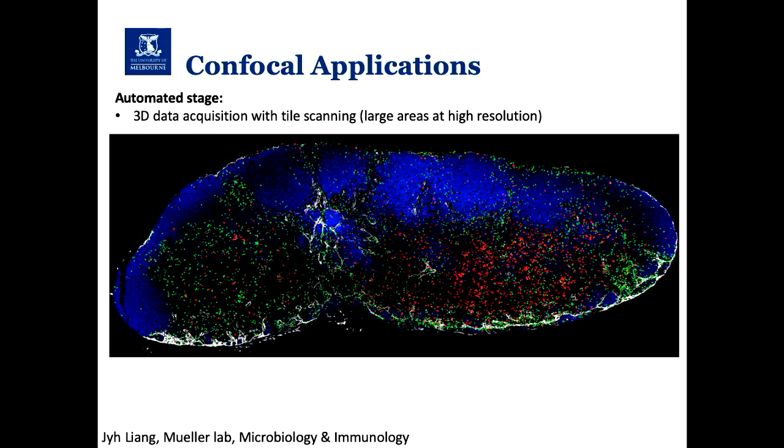So you can build up a large 3D model of the tissue that you're interested in. I've seen some labs presenting data sets which are 1 terabyte in size, massive high resolution information over whole organs. So you're limited by your imagination in terms of how much you can do.